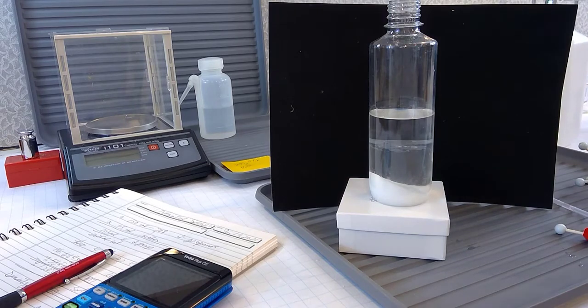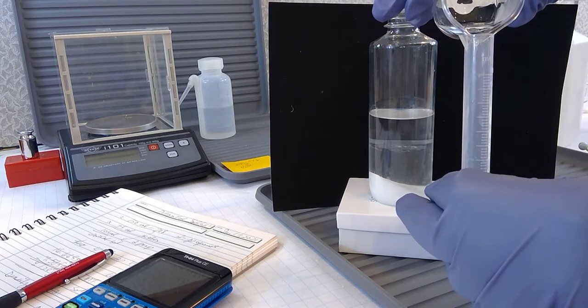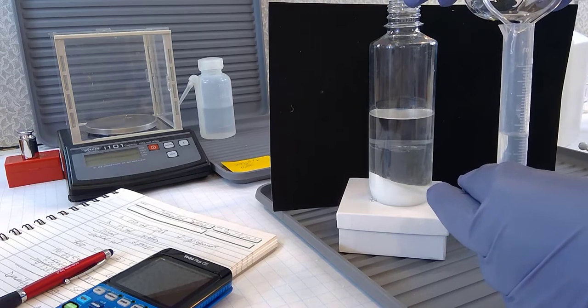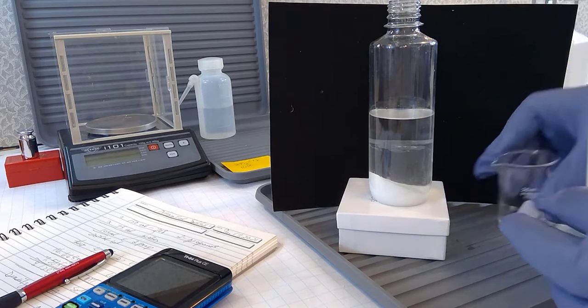Now the liquid inside here is primarily my new decanted propanol, and I'm going to pour in, I hope, 10 mLs. I may have to decant a little bit more. We'll see. Oh yeah, I will. So decant time.